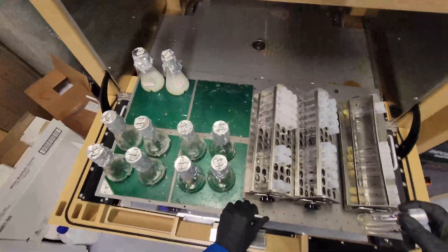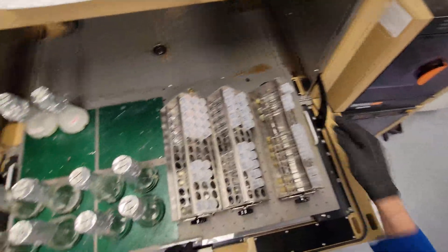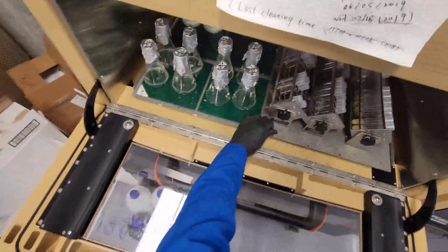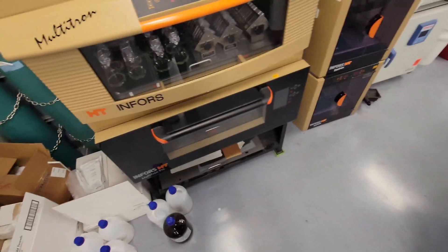So in this incubator, you can pull this whole tray out and just put your tubes in there. You don't have to take the tray all the way out, but if you do, you got to push it all the way in so that it stays and close it up. Let it shake overnight or however long you need. That's how you start a liquid culture.